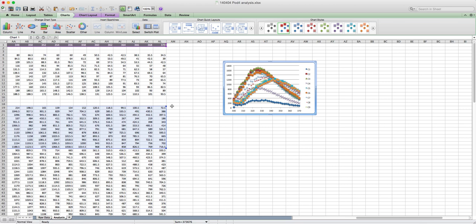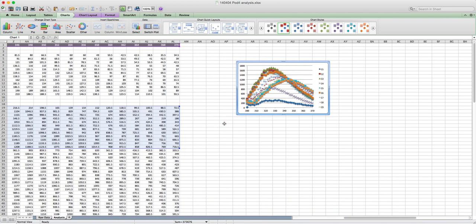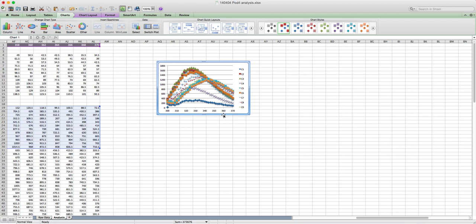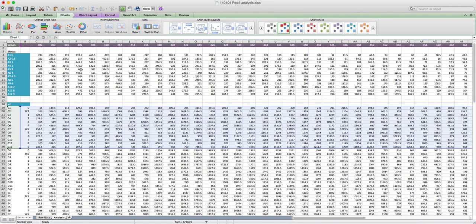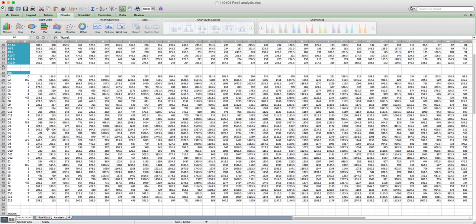You may be tempted, as you're watching this video and thinking about the analysis, to just plot the A data or the C data and not D and E. But it's actually important to stop and take a look at all of your data so you can see any points where you may have potential problems. So let me do that for all the other points.